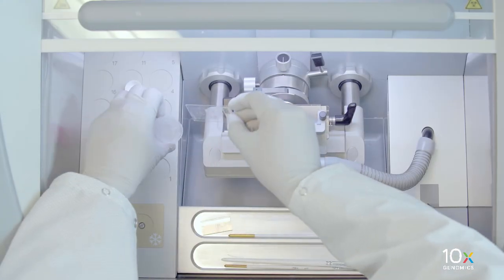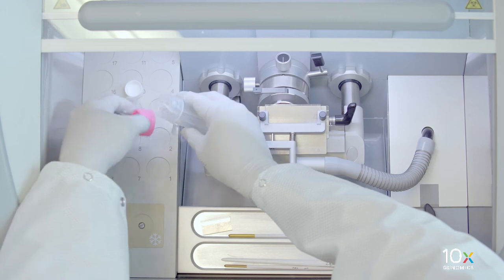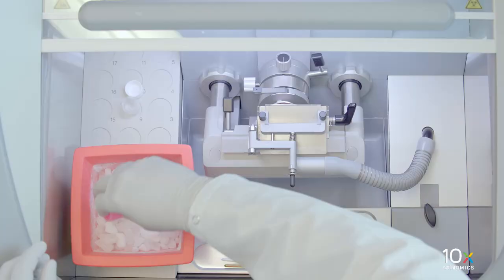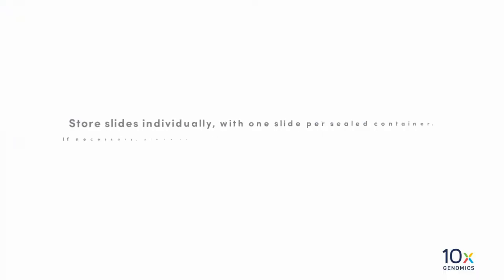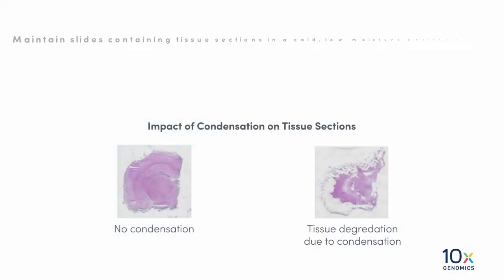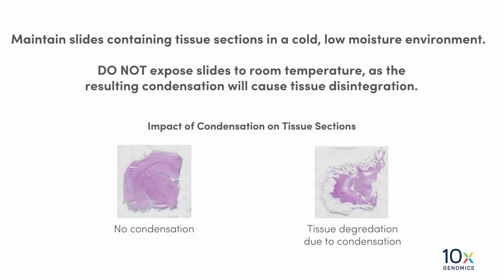Continue transferring sections on the remaining capture areas. Transfer the slide containing the tissue sections to a slide mailer. Seal and place in dry ice. If necessary, place the slides in a secondary container such as a resealable bag. Make sure to transport the tissue-containing slides on dry ice at all times. Maintain slides containing tissue sections in a cold, low moisture environment. Do not expose slides to room temperature, as the resulting condensation would cause tissue disintegration.